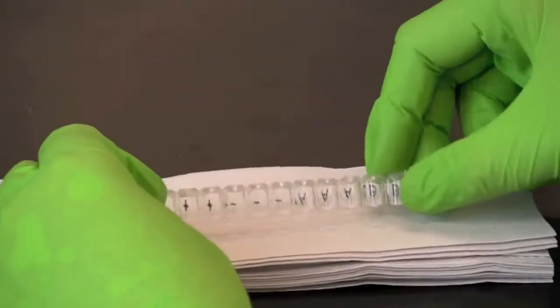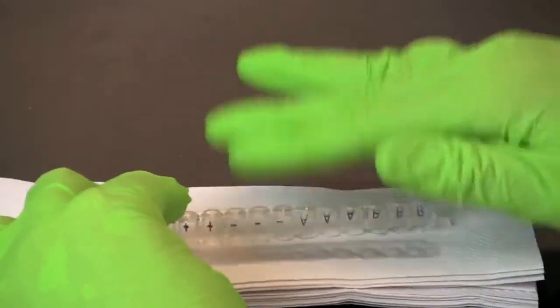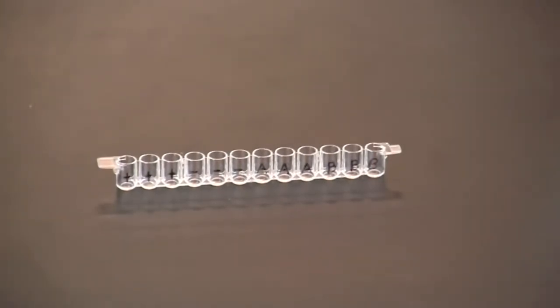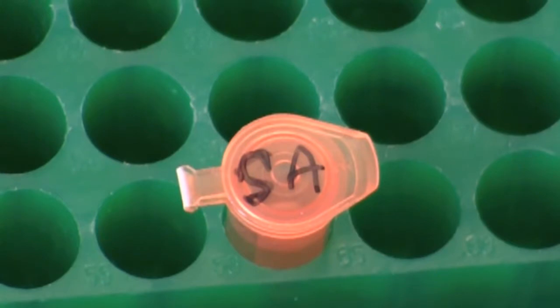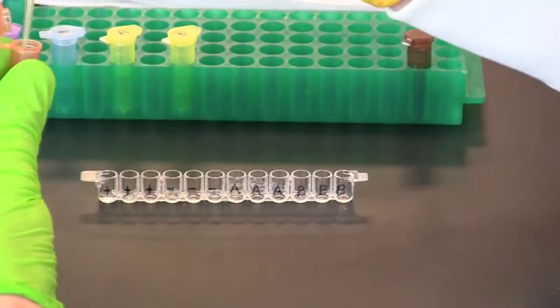Tip the microplate strip upside down onto a short stack of paper towels and gently tap the strip a few times to empty the wells of serum sample. Use a fresh pipette tip to transfer 50 microliters of secondary antibody, or enzyme-linked antibody, into each well of the microplate.